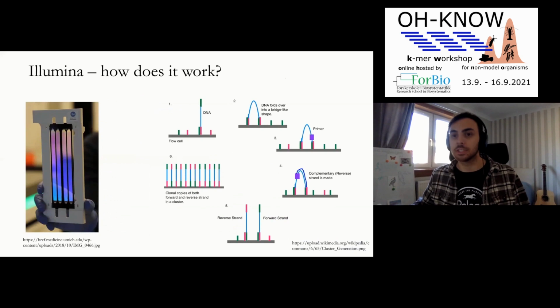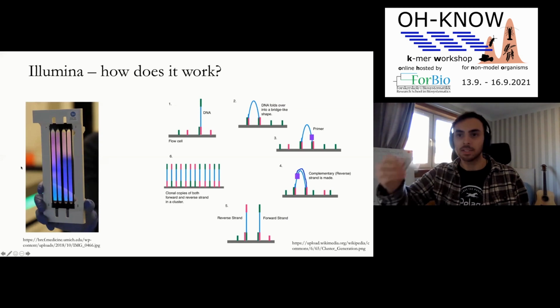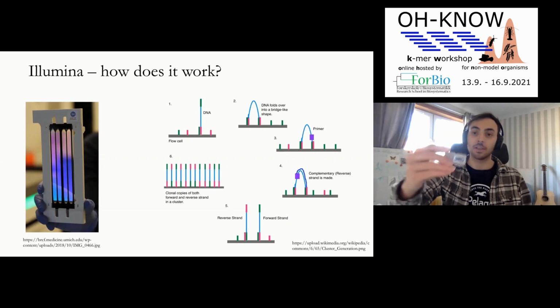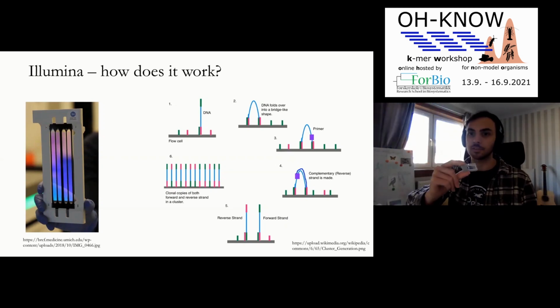Now, a lot of the other technologies actually use a similar approach, which is sequencing by synthesis, and Illumina is one of the ones that does that. This is an Illumina sequencing flow cell, which is from the new NovaSeq machine. I don't know how many of you have actually seen one of these, but I've got here, I think, a MiSeq cell from back in the day, a small cell that you would use in a MiSeq machine, and you can see that the difference in scale is pretty remarkable. This is the size of a stamp, if you can't see it.